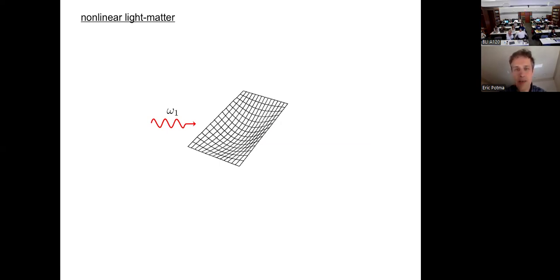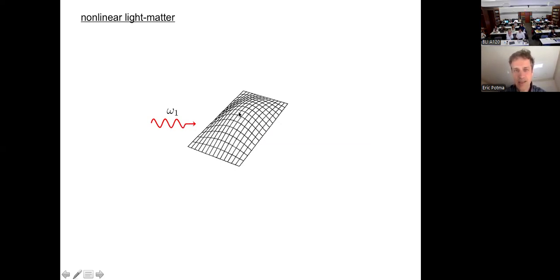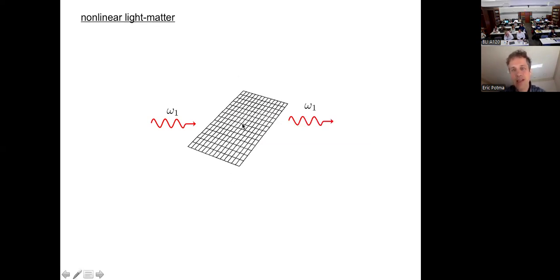Let's think about this membrane here as like an electron cloud that wobbles back and forth at the same frequency with which you send in the photon. Say this is 800 nanometers. Then this wiggling is basically the frequency of an 800 nanometer photon. Then the wiggling basically stops. In fact, it re-emits a photon, and this is what you get out. So simply one photon in, one photon out.